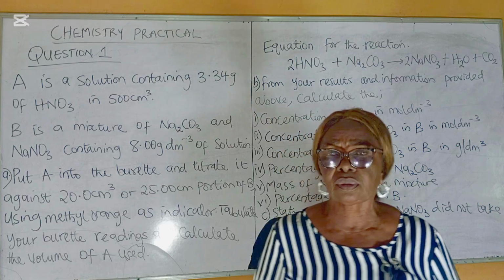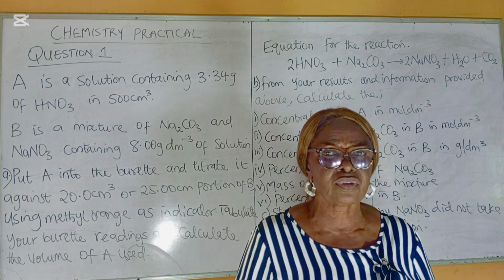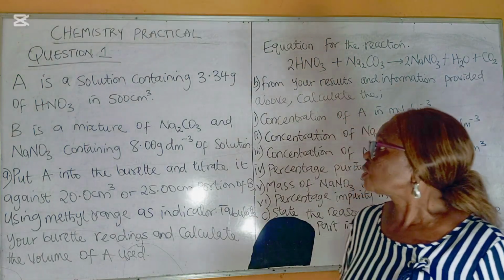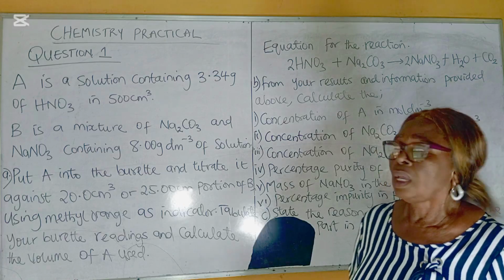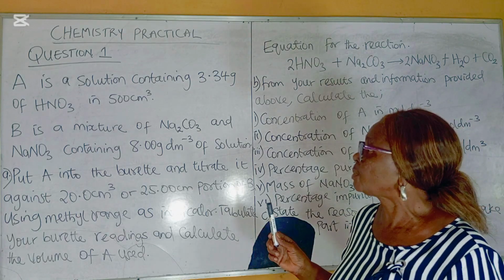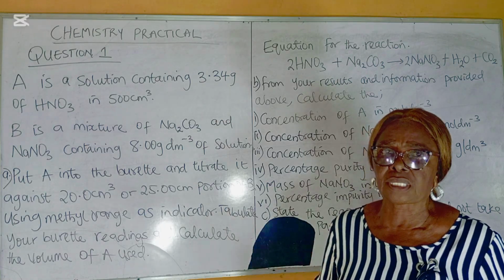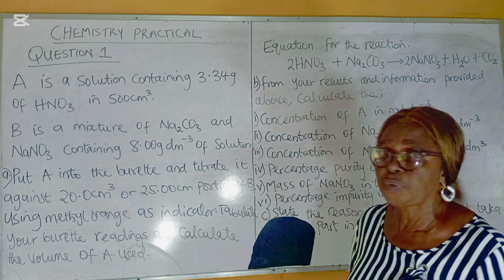I'm here to take you through some of the questions that are likely to come out for this coming NECO practical chemistry. So I have some questions on the board. I want to start with question number one. I don't need to do titration for the question, but I have to give you a titration table and say a little thing about it. So the question I have on the board is about purity.